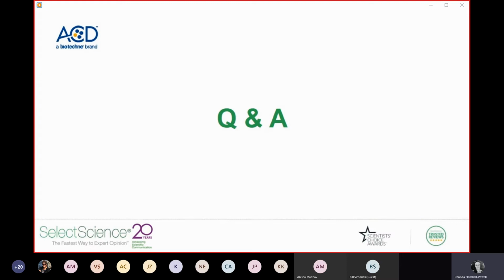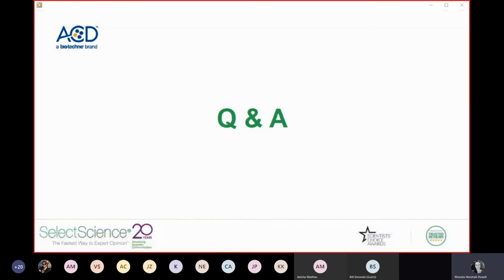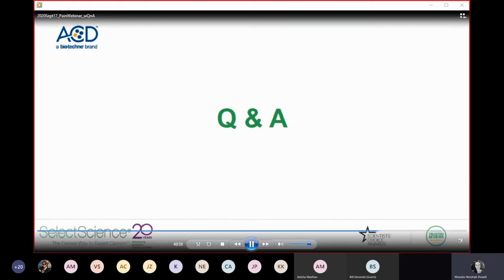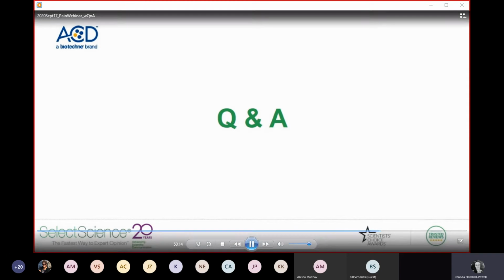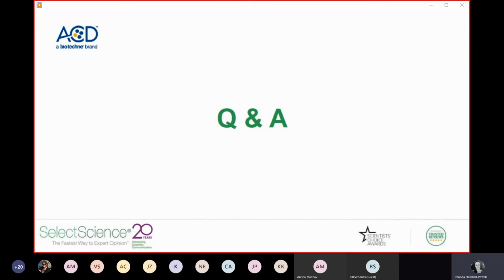I think that doing probably a single cell sequencing experiment would be the right thing to do on rats. Single cell sequencing has been challenging in humans, and I'd be happy to talk about why that is, if somebody has a question about that. But I think a DRG single cell sequencing experiment on rats would go a long way to help us understand at a global level how the populations of sensory neurons differ between mice and rats. And eventually, when we get to the point where we have that kind of high throughput data for human as well, then I think we'll be able to do quite a bit.